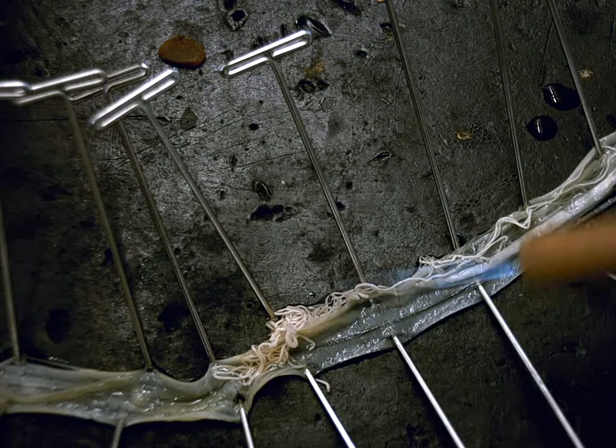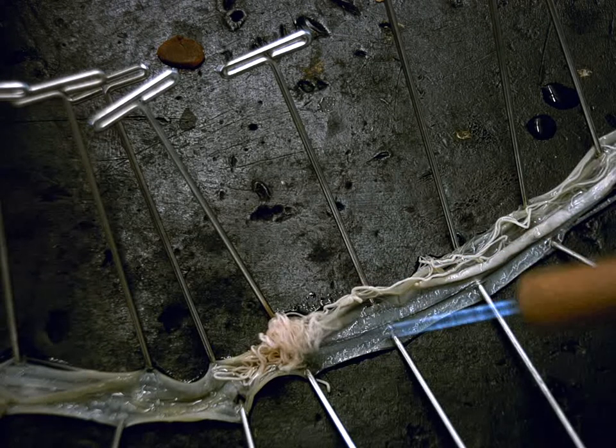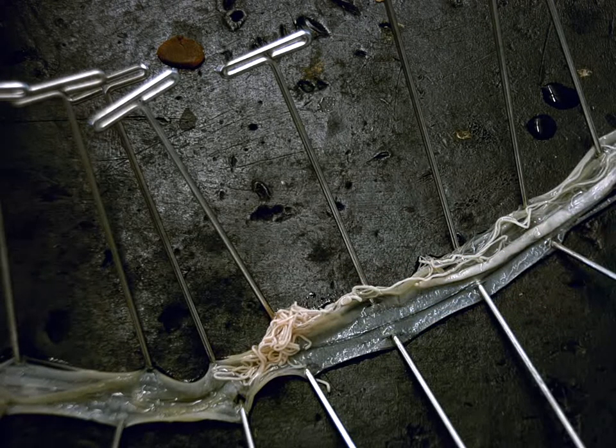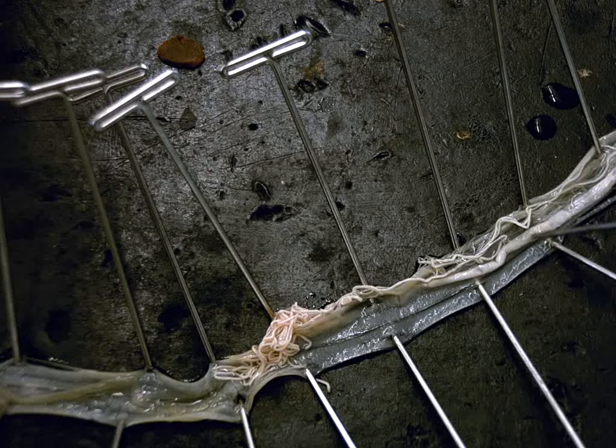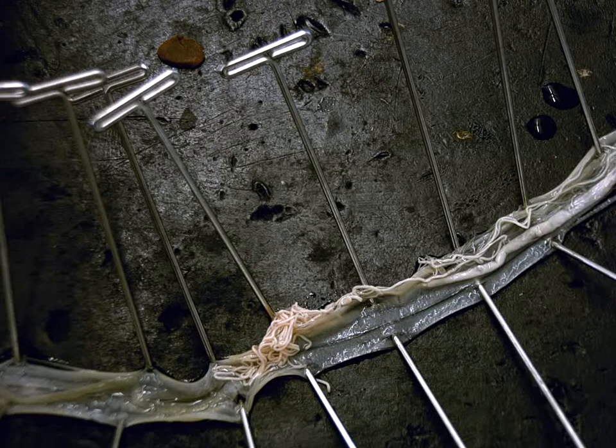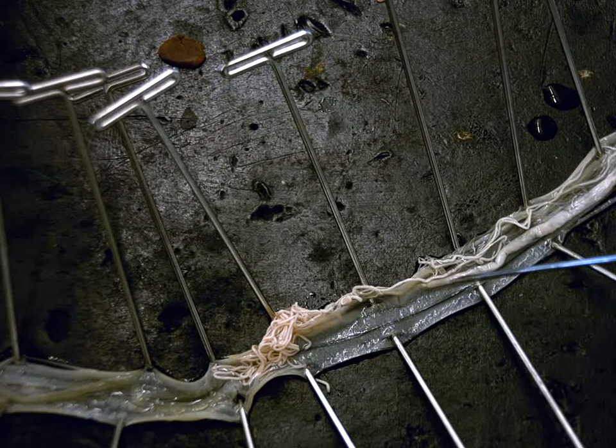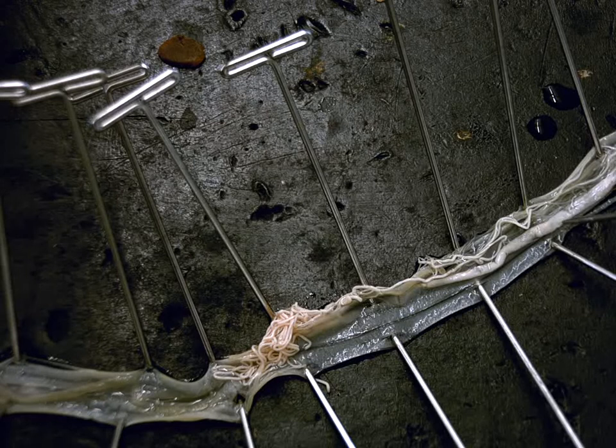The medium sized ones, which are actually more coiled up up here, would be the vas deferens. And then this one single thick tube that runs towards the posterior tail, this whole single thick tube would actually be the seminal vesicle.